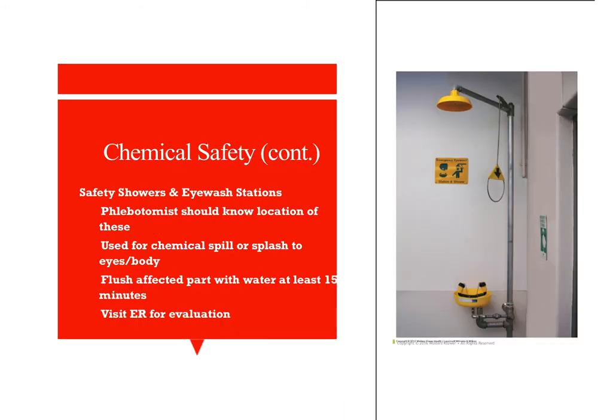Safety showers. You should know the location and use of these showers in the lab. They're used for chemical spills, splashes to the eyes or body. You would stand in the shower for 15 minutes, probably with no clothes on, and they're in the middle of the lab. Let's just be safe with our chemicals, okay?